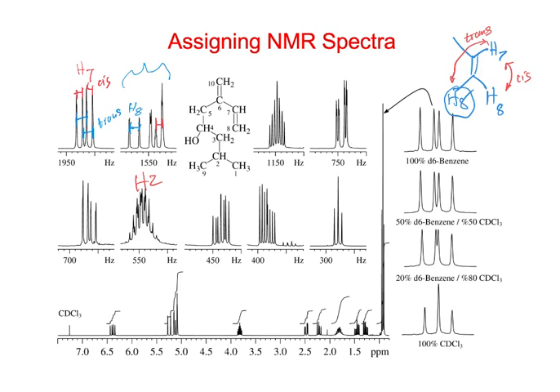I guess that's not what I had in my notes, but that's what it looks like here. Do that again. So it's that small one here. But yeah, it doesn't really look like it matches that. So it's got to be over under there. Okay. So that red there has to be the other H8. Okay, and then we have the other two H10 protons.